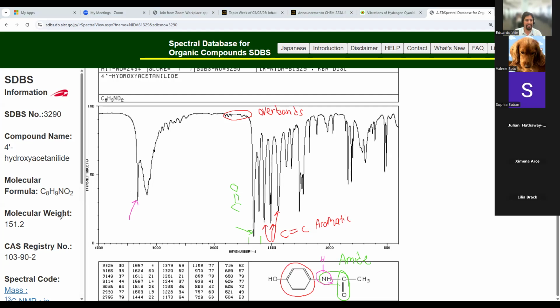All right? And then we also have a phenol hydroxide. I'm going to use, let's see, what color haven't I used yet? Blue. So this OH right here, well, hydroxides usually make broad peaks, right? So even though we don't specifically see which of the peaks it is, we can definitely say that the broadness of this is caused by your OH peak. So which of the two is it? Well, it could also have blended with the other peaks. But the fact that it's broad in general and that it's part of the structure means that you can claim that this broad compound peak is your OH peak.